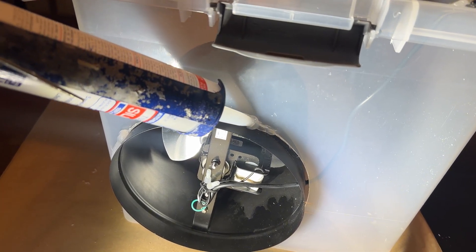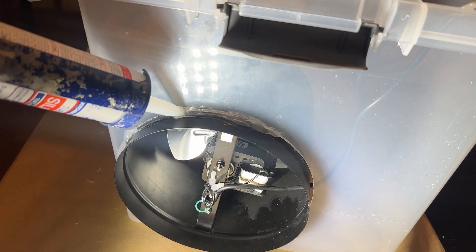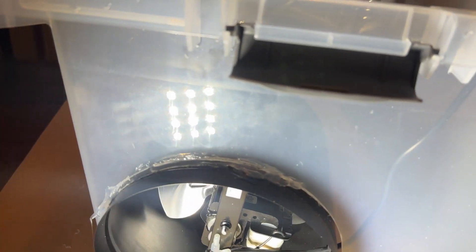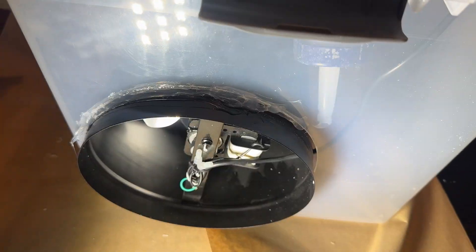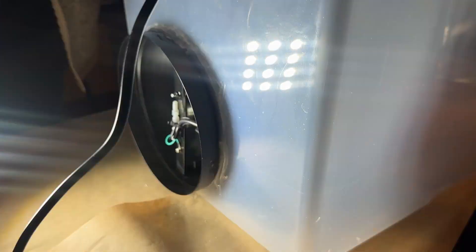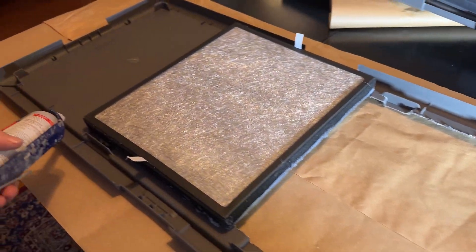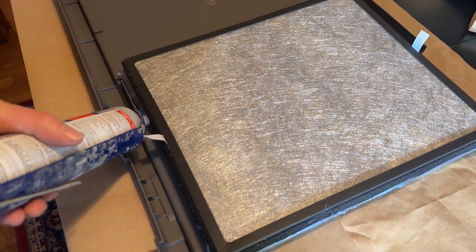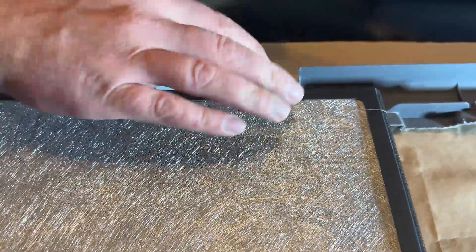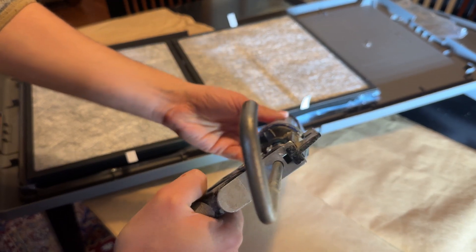Next we need to caulk all of the air gaps, starting with the ones around the fan. The easiest way to make a good seal here is to caulk both the inside and the outside. Then we're going to use more silicone caulking to secure the HEPA filters in place. We'll do the inside first, then wait a day or so for the caulking to dry, and then the next day we can also do the outside in case there are any more air gaps.